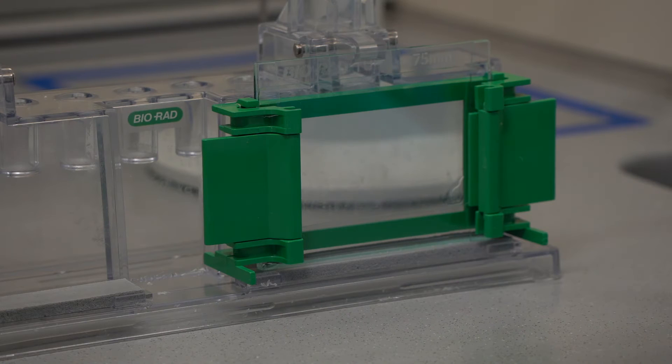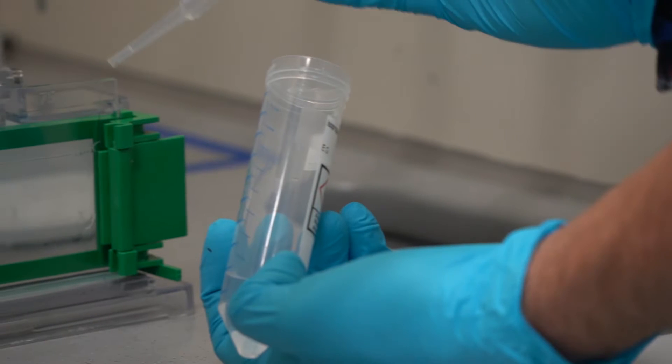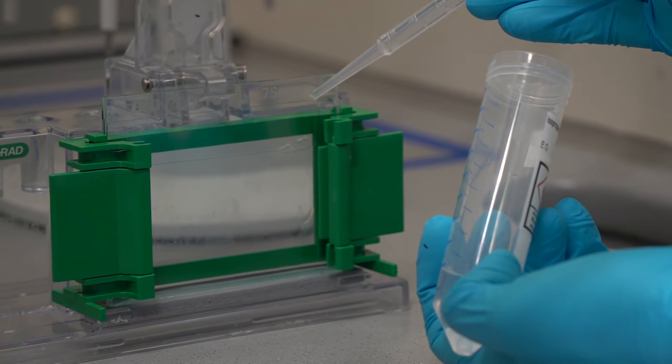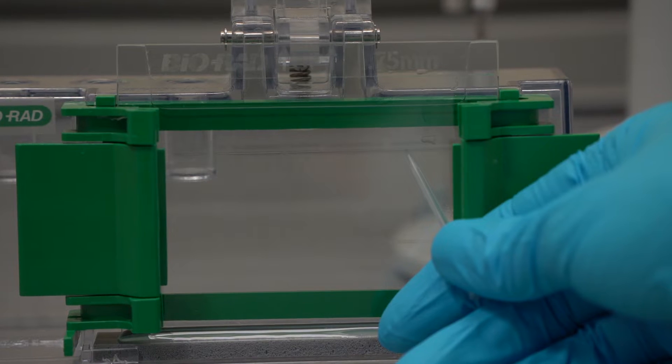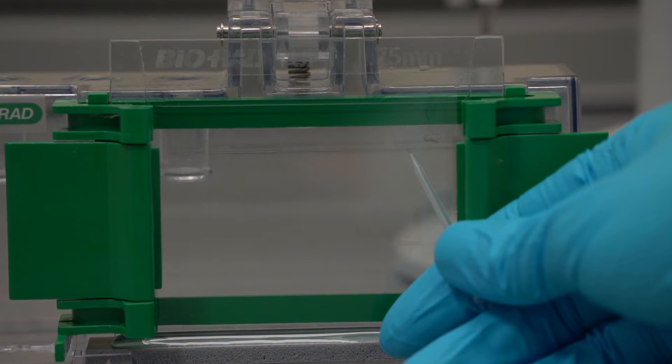Pipette the running gel solution between the glass slides to approximately 10-15mm below the top of the shortest glass plate. Carefully fill in the remaining space between the glass plates with isopropanol. This ensures that the top of the running gel is completely straight. Now let the running gel polymerize.